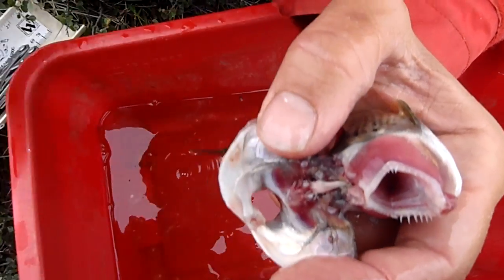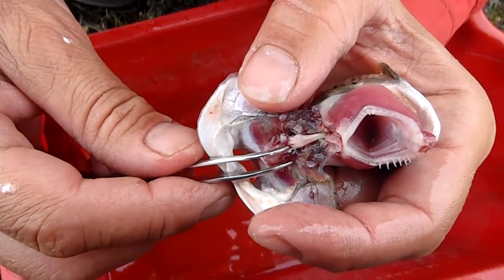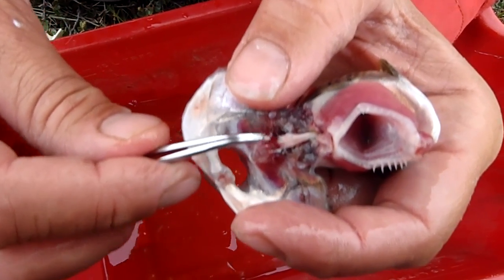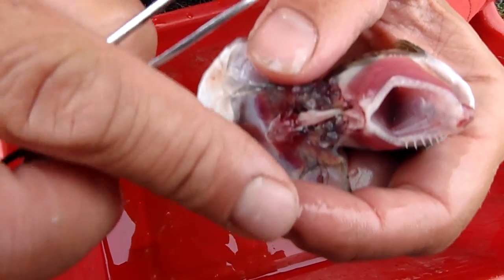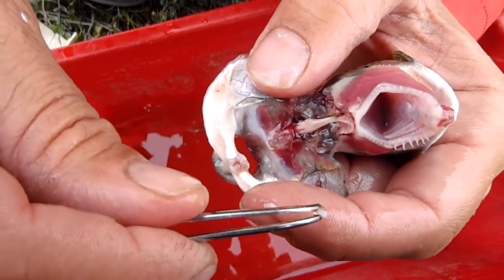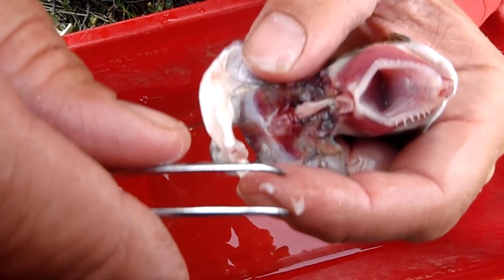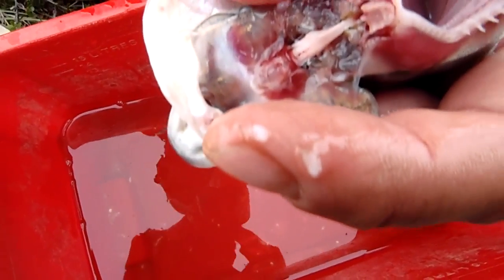We'll just keep it open with my fingers here and I'll grab my field tweezers. There's one otolith right there — it's sliding off my finger. There we go. And the other otolith is right here. There. Okay. And there's your one and two otoliths from an Arctic Grayling.